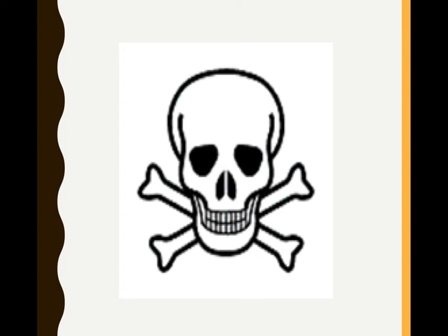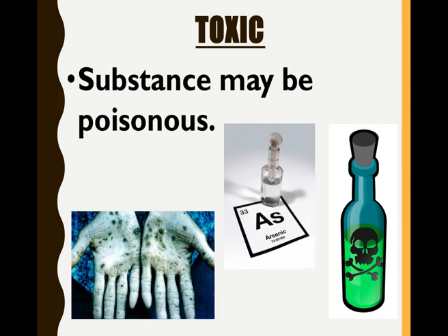Take a moment. Tell me what you think this symbol means. Probably one of the easier ones for you to be able to guess what this one means. This one means toxic. It's a substance that's poisonous if you ingest it, or even some poisons if it gets on your skin and can absorb through your skin. It can be very dangerous.